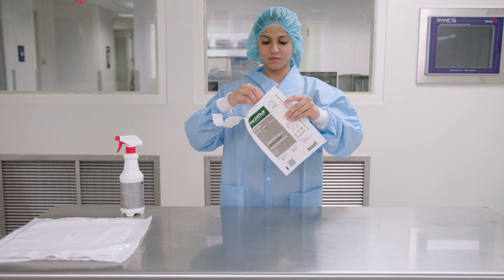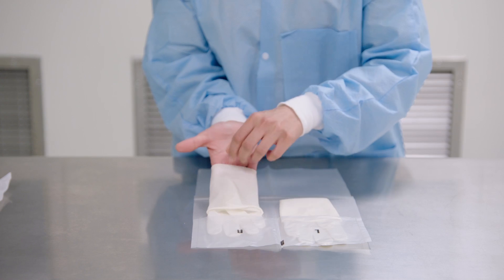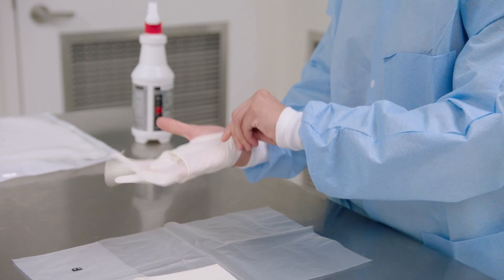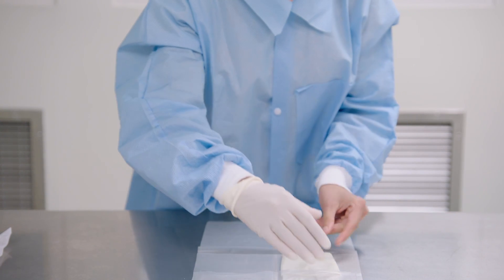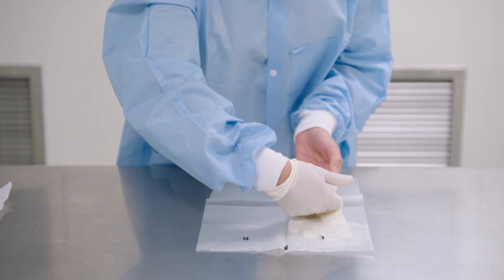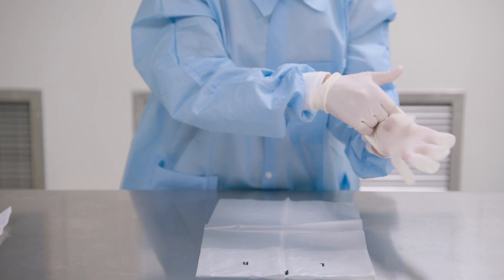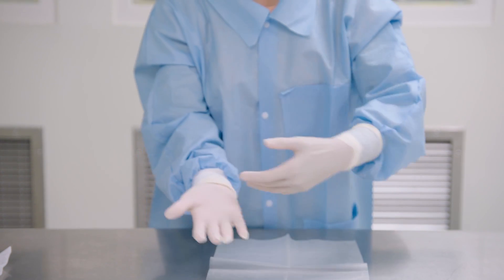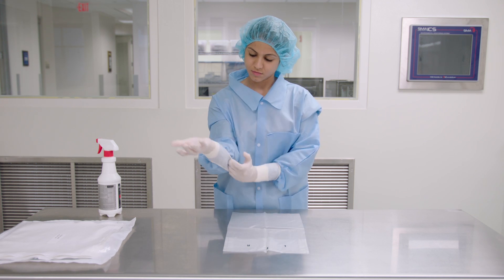Start by opening the package. Pick up the cuff of the right glove with your left hand. Slide your right hand into the glove until you have a snug fit over the thumb joint and knuckles. Your bare left hand should only touch the folded cuff. Slide your right fingertips into the folded cuff of the glove, pull out the glove, and fit your left hand into it. Unfold the cuffs down over your gown sleeves.